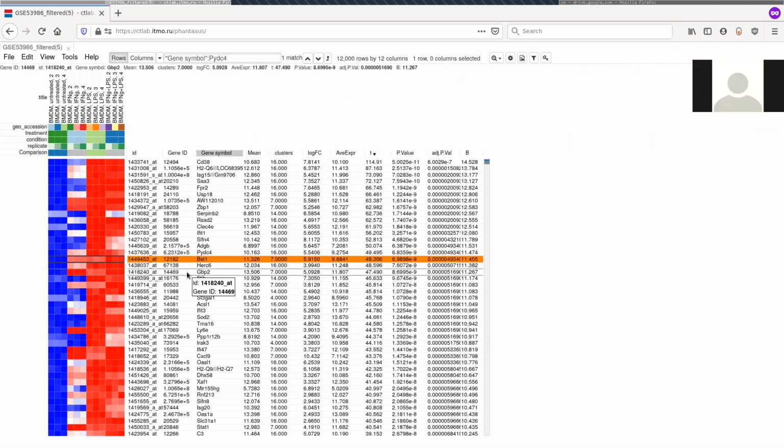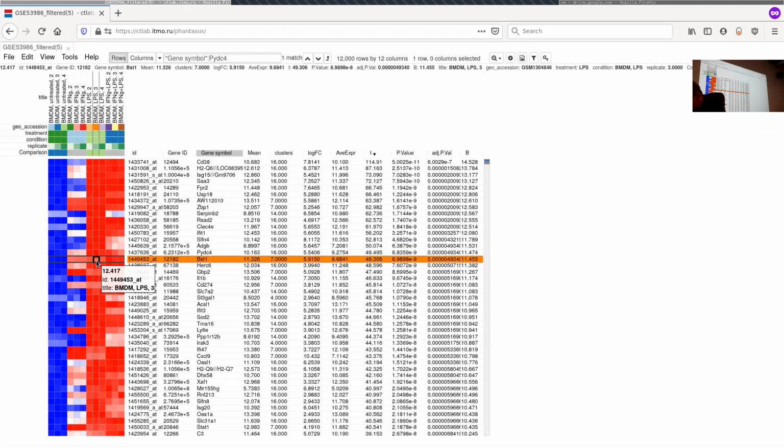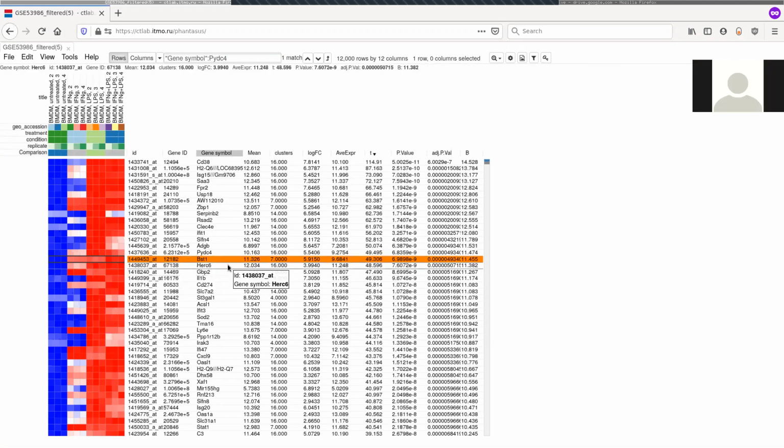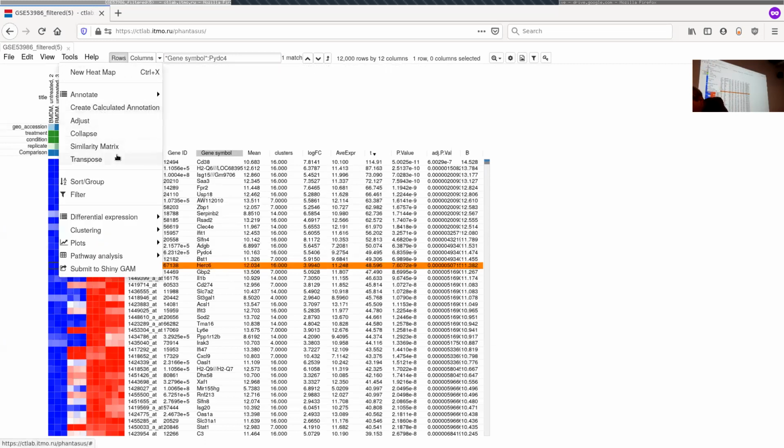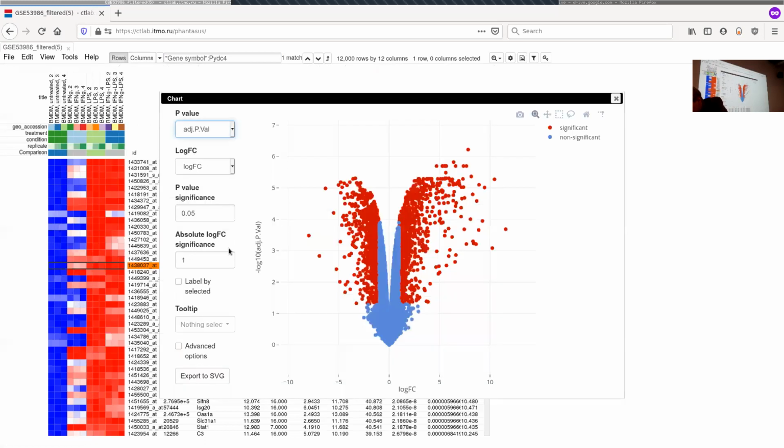So it has a difference, but I would say that this difference is not as big as the next gene has. And why then do we have this gene ranked higher than the next gene? Actually, I would say otherwise. So there are two things, and actually, let's see. Hopefully, it will work.